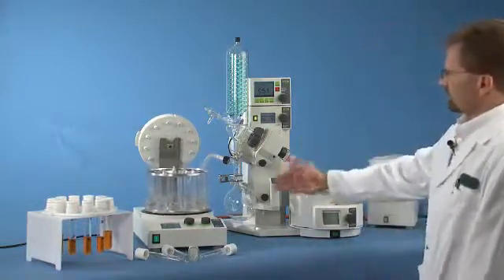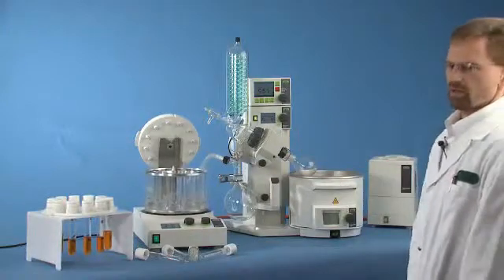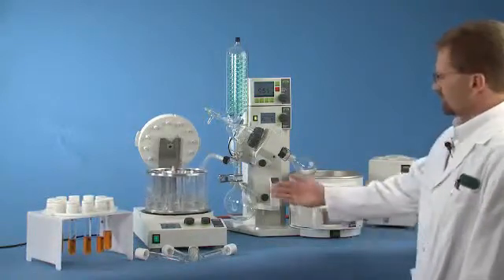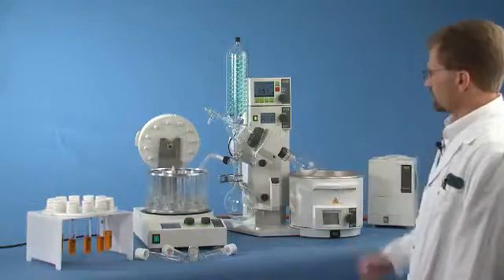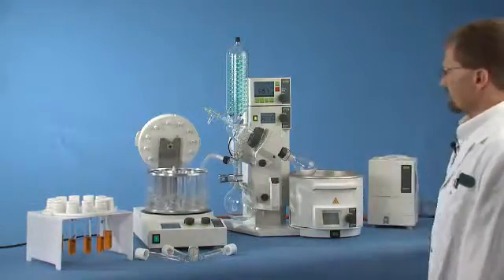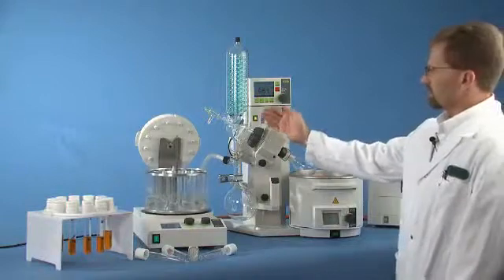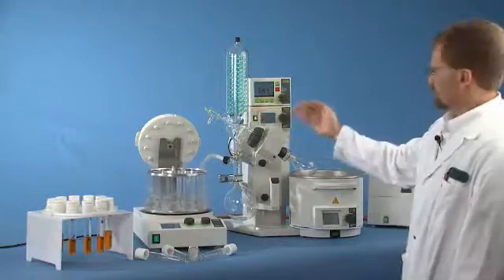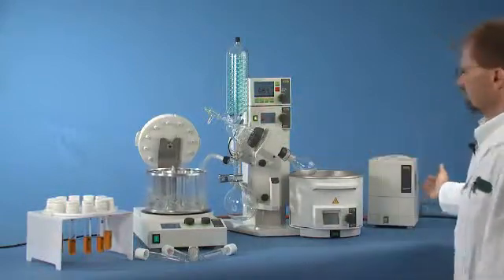First of which is it allows you to multiply your existing rotary evaporator. You simply hook up the Multivapor to your vacuum source on your existing rotary evaporator. So the Multivapor utilizes your rotary evaporator condenser, vacuum controller, and vacuum pump.